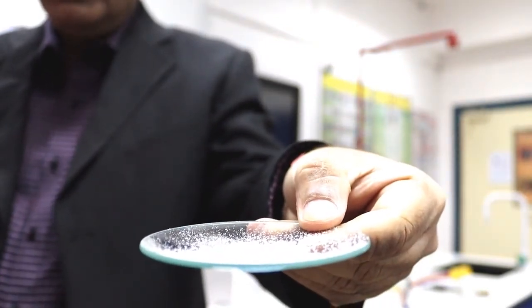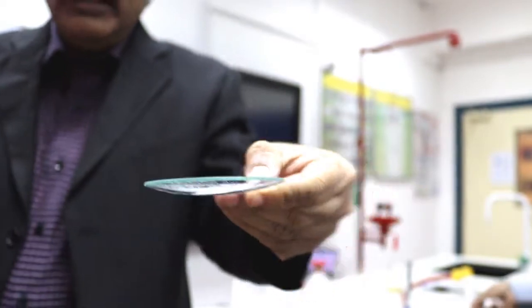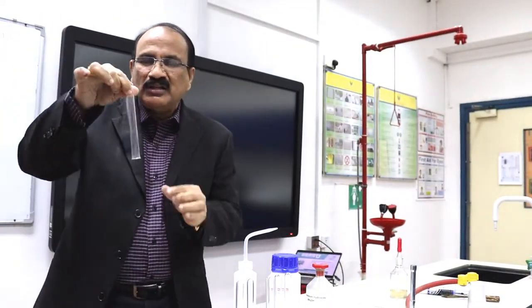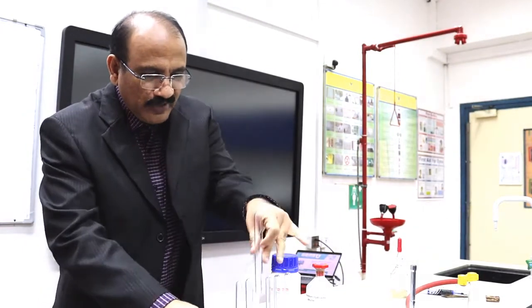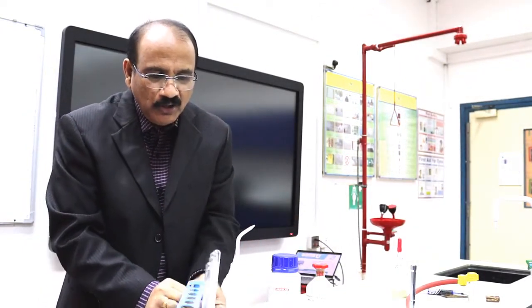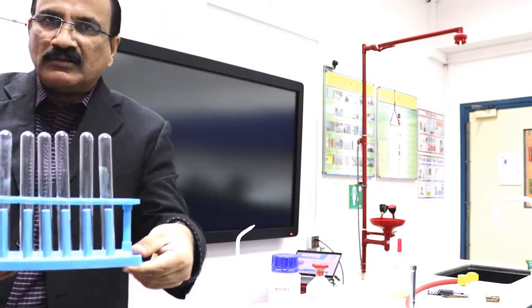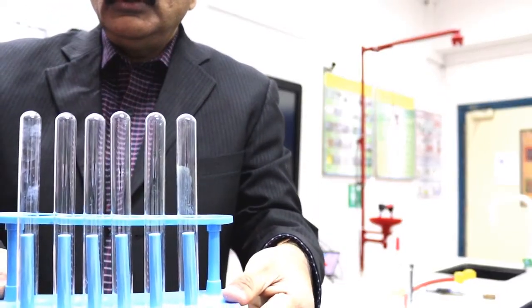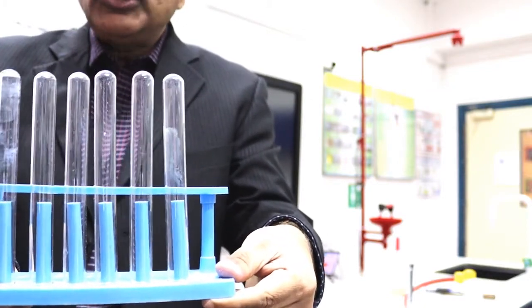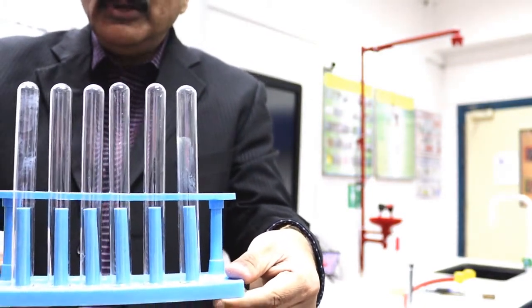So first test is, take a little bit of salt in a dry test tube. Please ensure that the test tube is dry. Whenever you are doing the practical, please ensure that you are keeping all the test tubes in this manner. After washing, you have to keep the test tube in the inverted manner so it will always be dry.